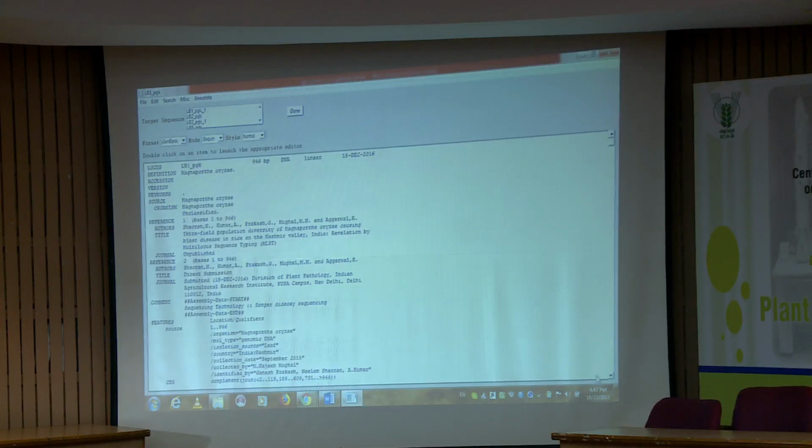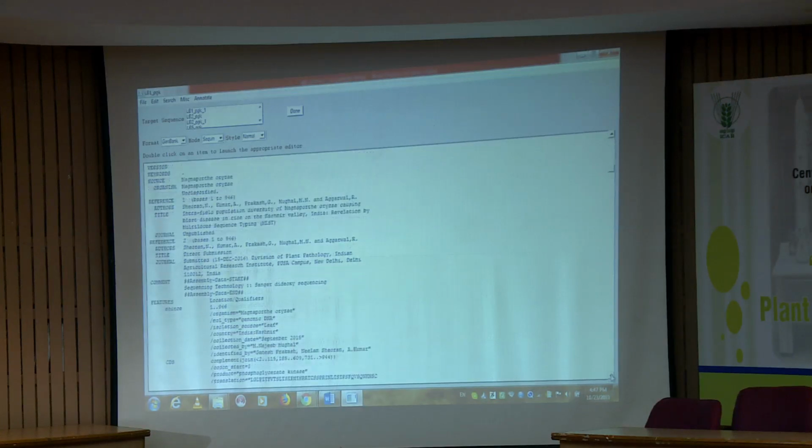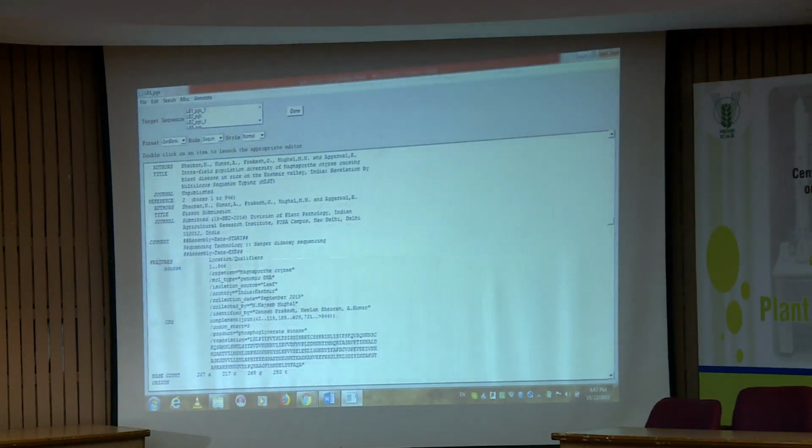Then you go down. This is again regarding whatever information I was telling you: keep it ready in some document and keep on copy-pasting it. You do not have to waste time, as you cannot do everything on the spot; keep the things ready and keep on copy-pasting.